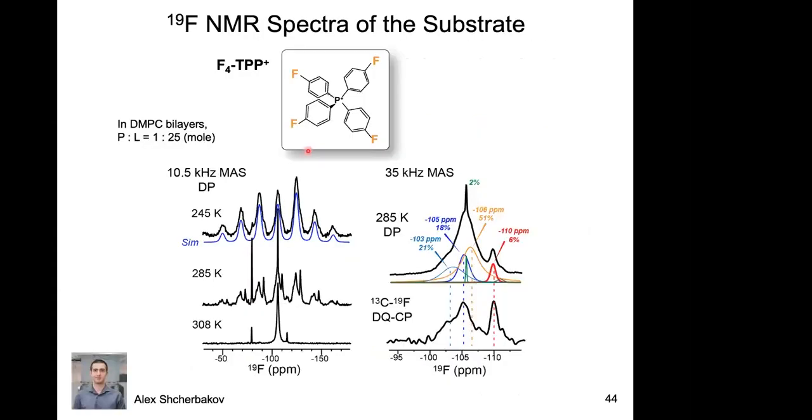And so what we did in collaboration with Katie Hansen-Waldman's lab is to basically take advantage of a fluorinated version of a commonly used EMRE substrate, this molecule called tetraphenyl phosphonium. There are 4 phenylene rings, each one actually at a para position. Now, instead of hydrogen, you get a fluorine, and the central atom is the phosphorus. And so that's very interesting. Katie Hansen-Waldman's lab is able to show that this fluorinated substrate works basically as good as the regular hydrogenated version, and the protein can take that and pump it out.